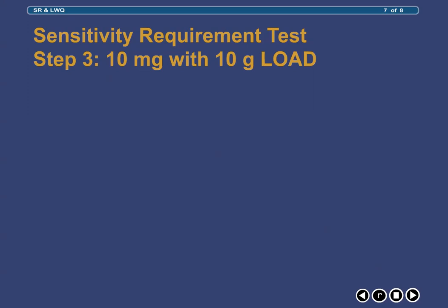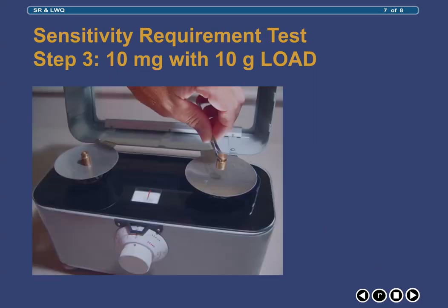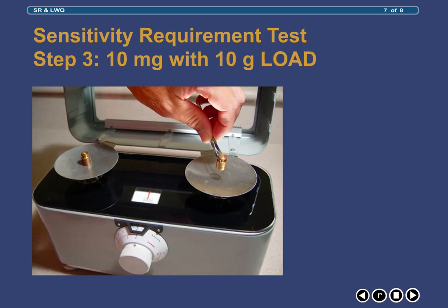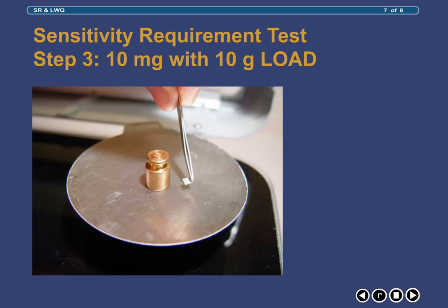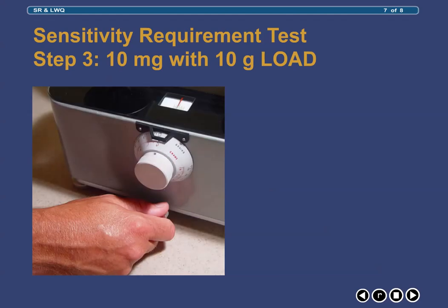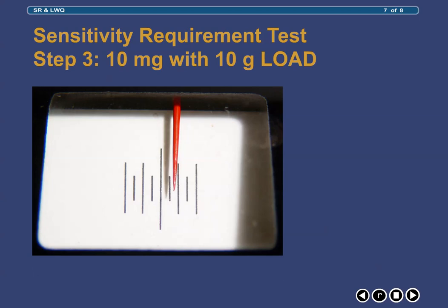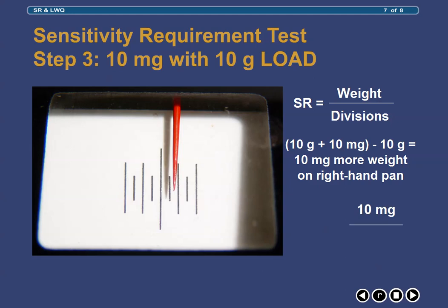The final step is to perform the sensitivity requirement test as outlined previously, only this time with a 10 gram load on each pan. Again, before proceeding, ensure that the balance is level. Then place a 10 gram weight in the center of each pan, followed by placing a 10 mg weight on only one of the pans. Then release the locking arm and again observe the pointer to see how many divisions it moved from its original rest point. In order for the balance to pass the test, 10 mg should again move the pointer at least one and one half divisions with the 10 gram load, just as it did without the 10 gram load.